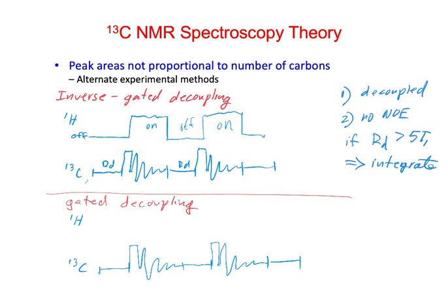So it's going to turn on during the pre-acquisition delay and then turn off during acquisition. So on, off, on, like this.